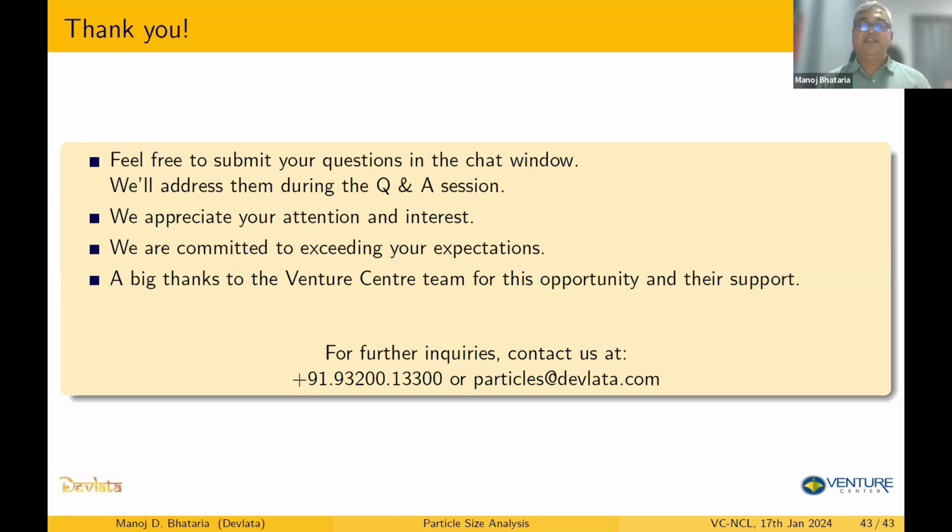So that leaves you some scope. Now, based on the volume of the particles that you have and the suspension volume, you can get a fairly good estimate of the number of particles you can have in the suspension. Okay. Now, this is all calculation and that work.